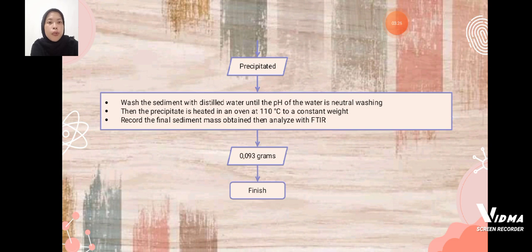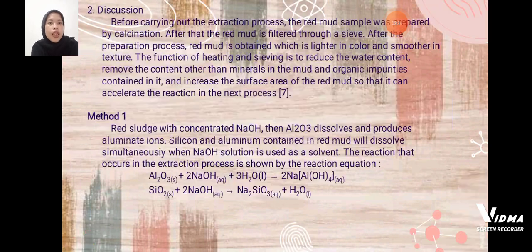Record the final sediment obtained and analyze it with FTIR. From the practicum, the mass obtained is 0.093 grams. Finish. The next discussion.